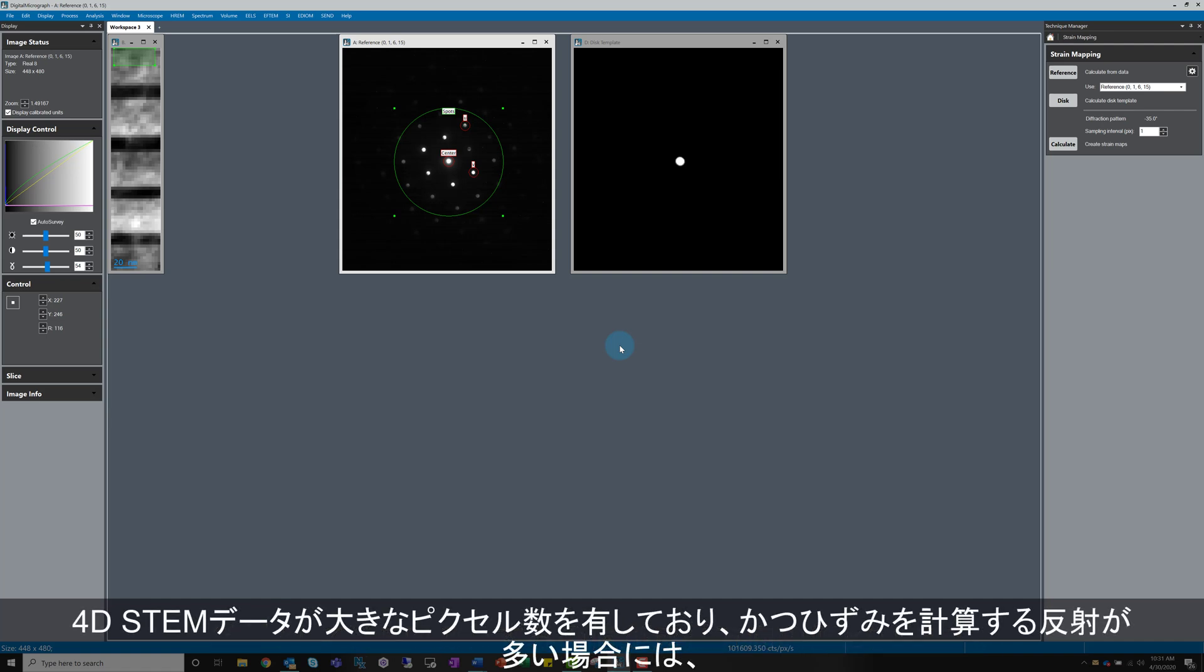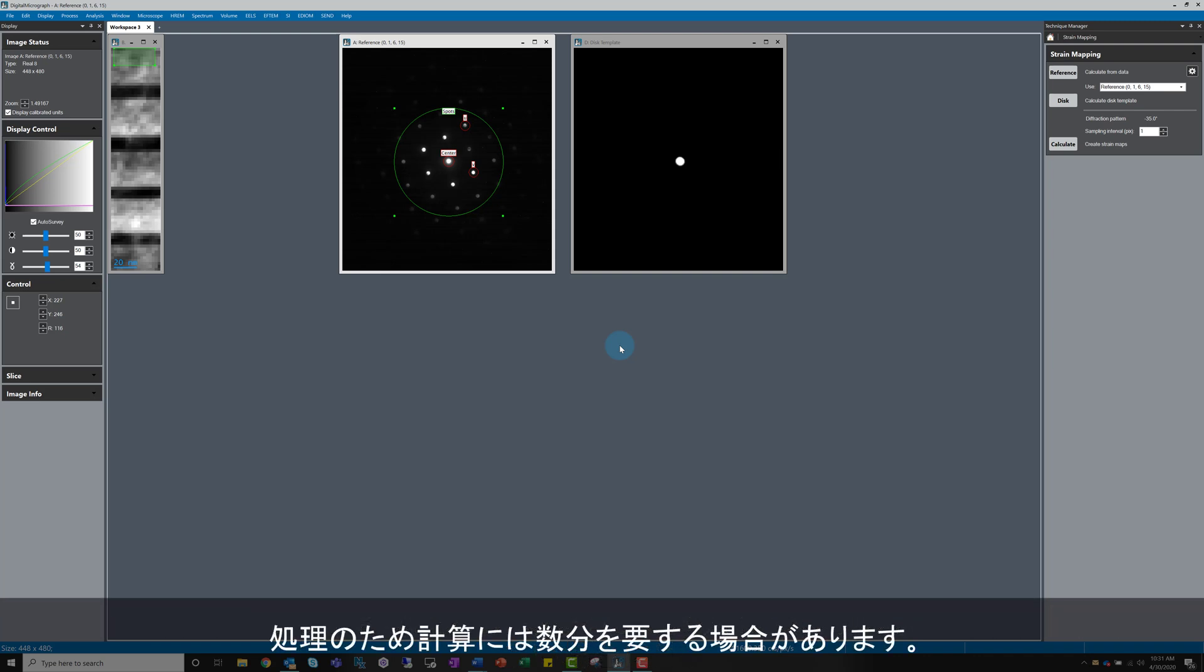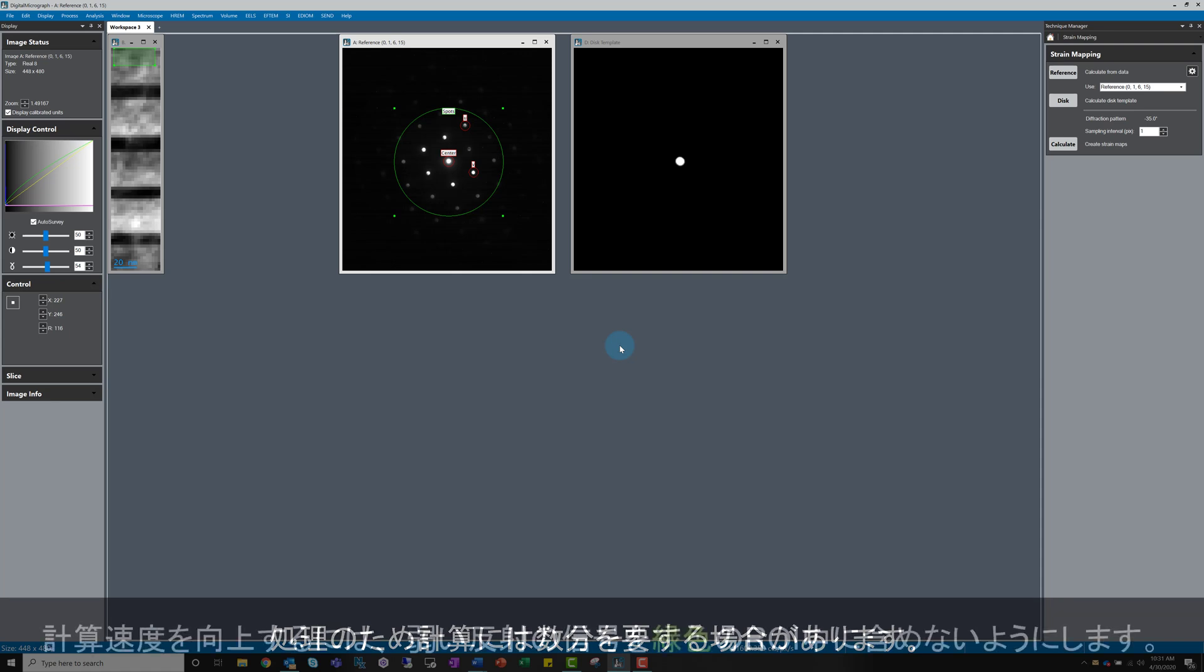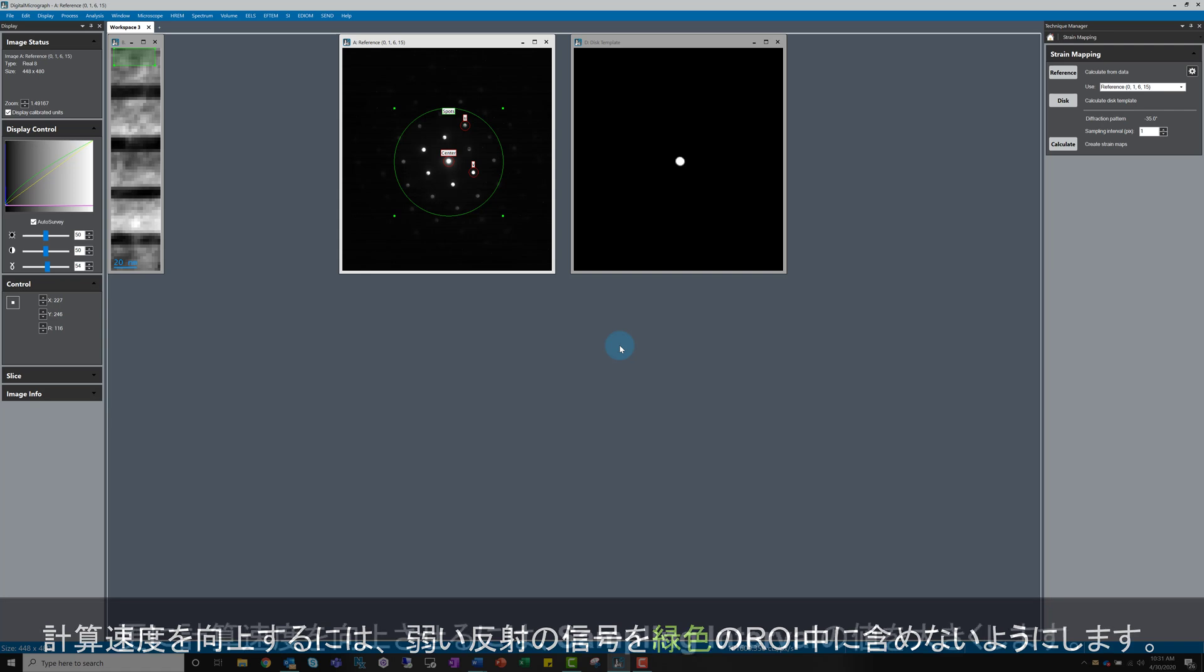If your 4D STEM data has a large number of pixels and you also decide to include a large number of reflections in the green circle used for the strain calculations, the calculation will take several minutes or more for the software to output the strain maps. As I mentioned already, avoid including reflections with weak signal in the green ROI to improve calculation speed.